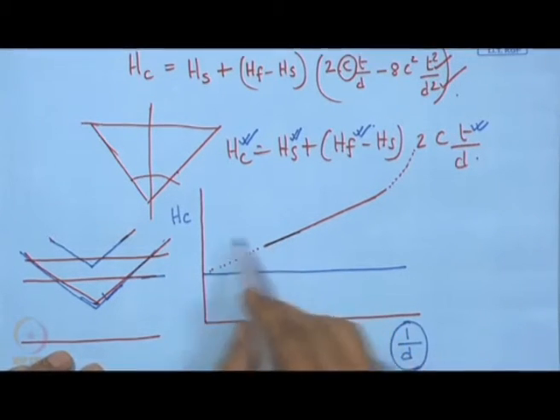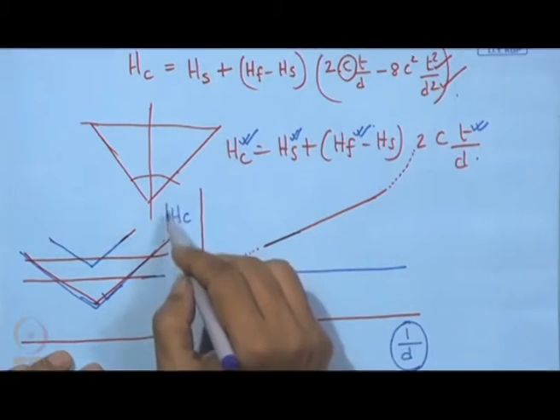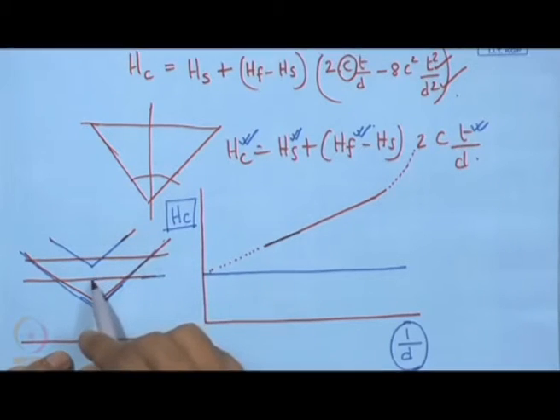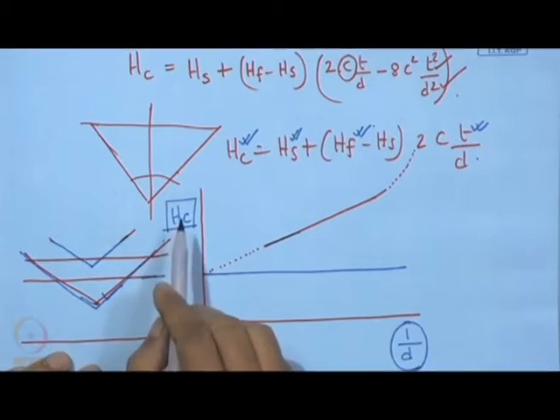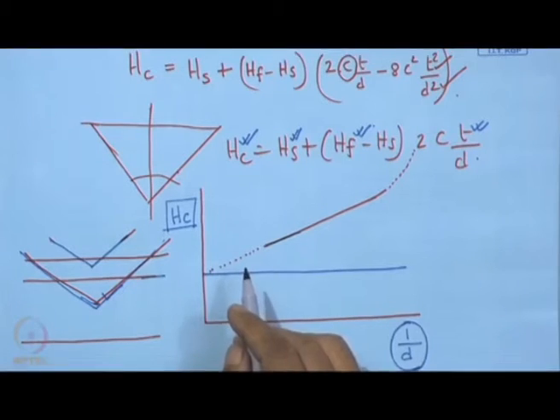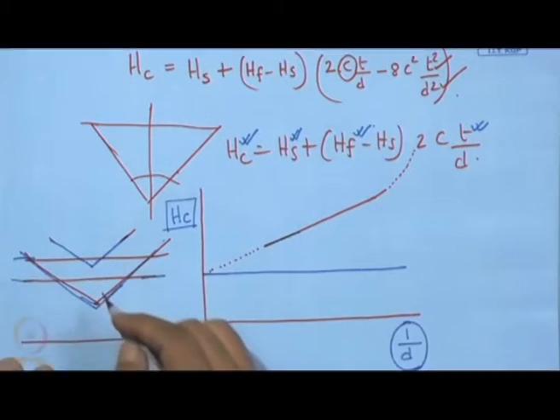In that case this composite hardness, it is actually the hardness of both coating and substrate which are contributory, but in this case the hardness of the substrate has a greater contribution than that of the coating, and this way we can find that the value is coming more towards this side.